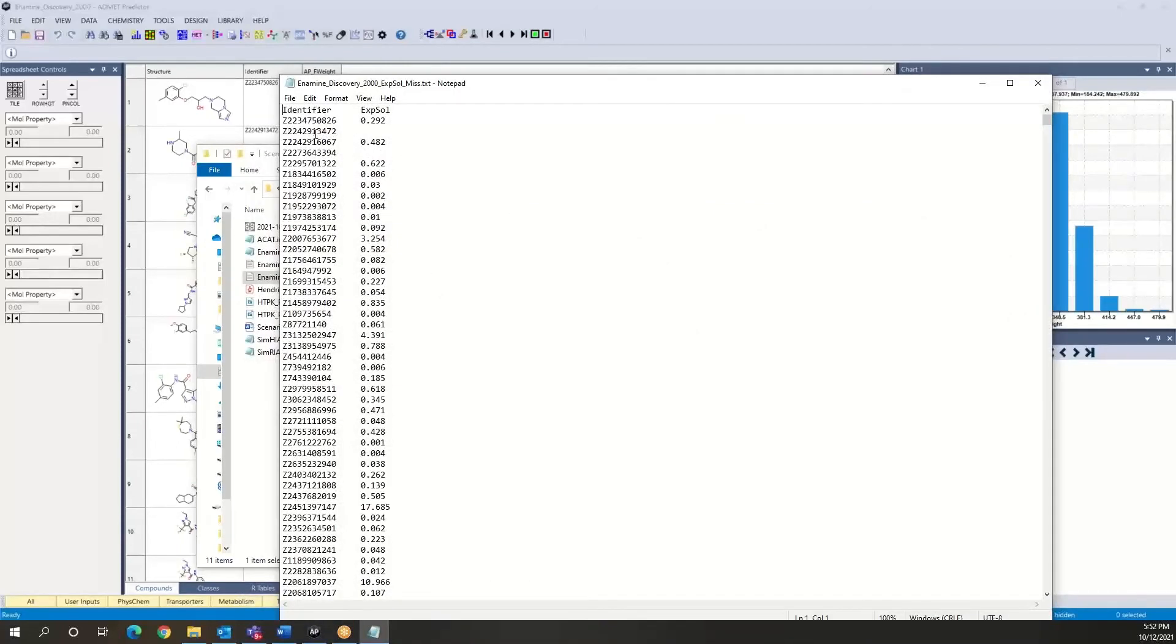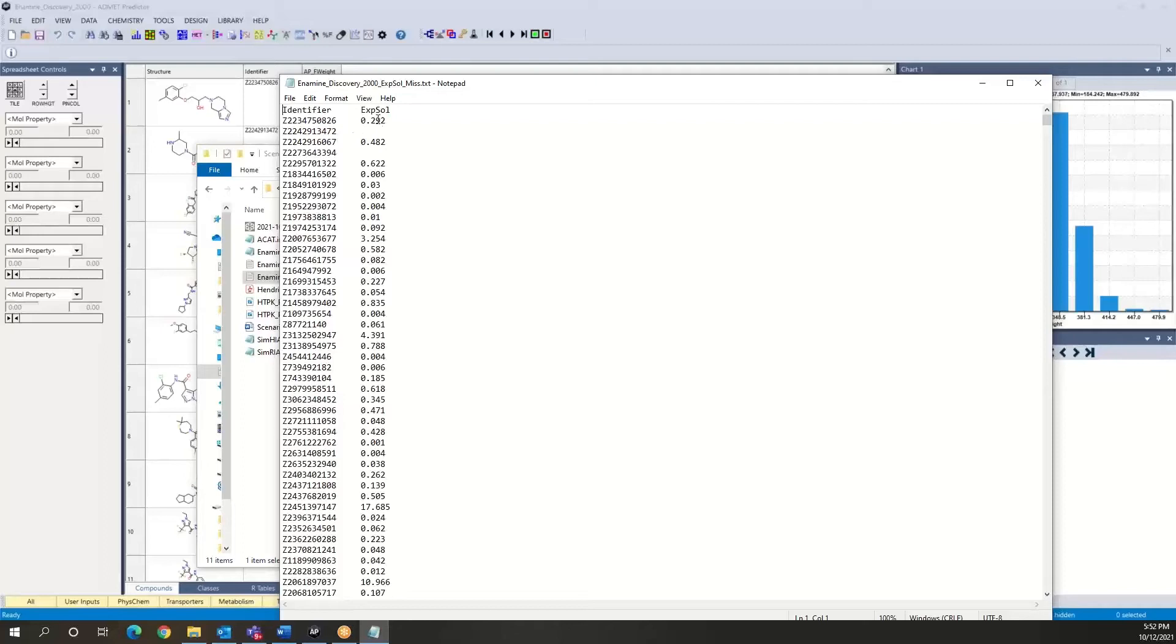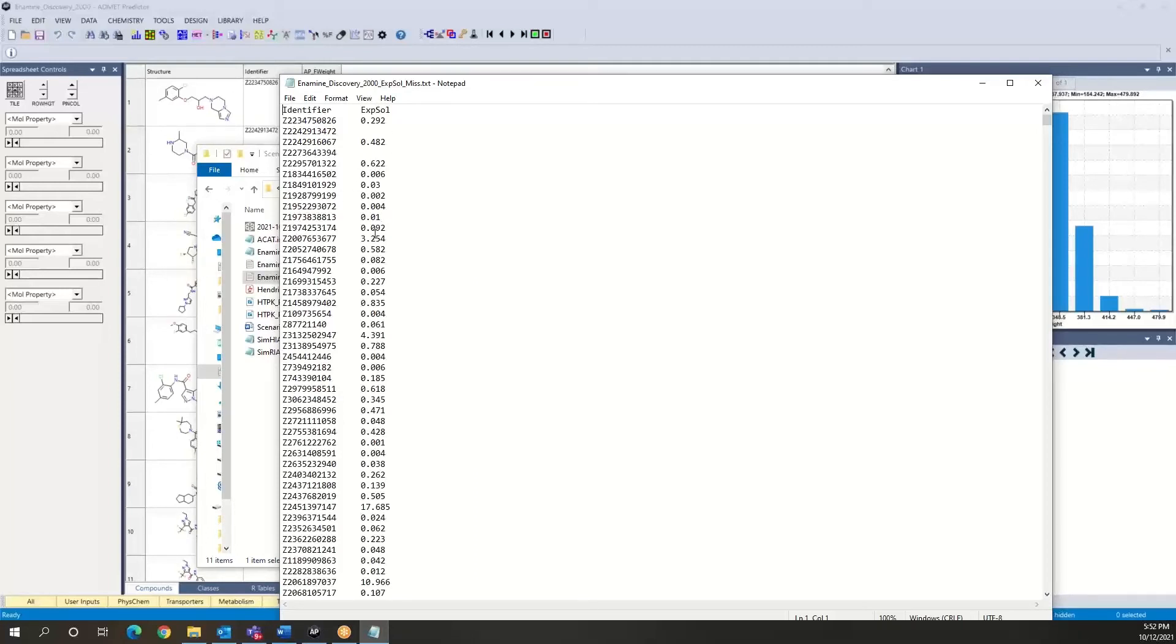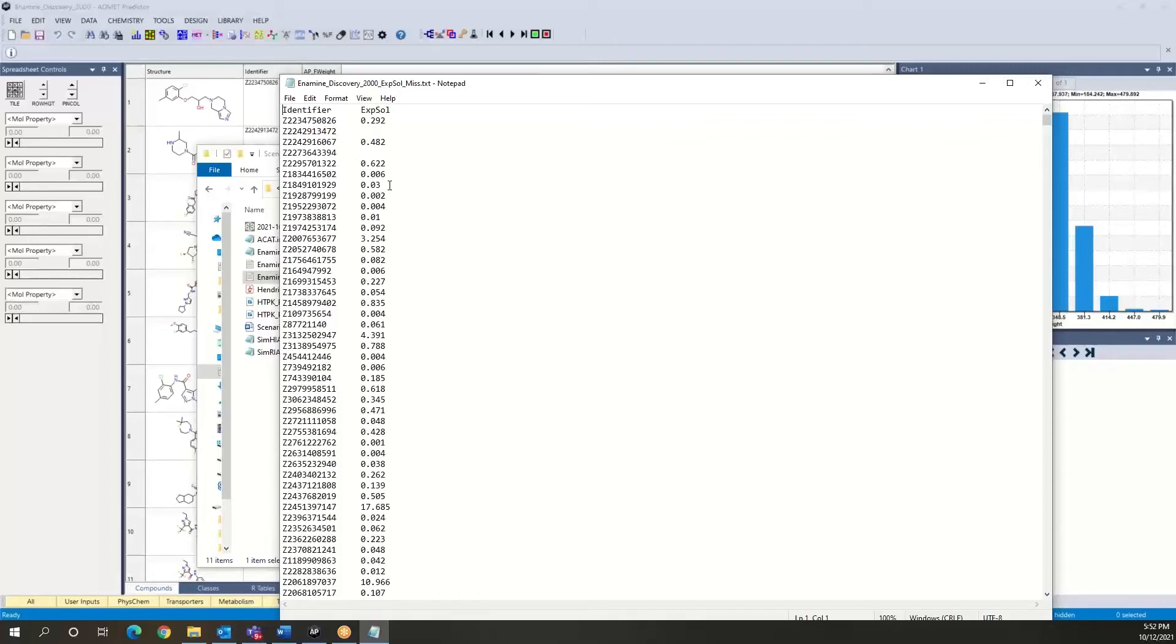And this is data that I have generated for the purpose of this exercise to show you how you can do these sorts of things. This simulates the case where we would have experimental solubility values for these compounds. The file assembles the identifier, which is actually essential for making the correspondence with the spreadsheet, and this experimental solubility value that we wish to import. You notice here that I have actually removed the data for a couple of the compounds just to show you how the software behaves when data is missing.